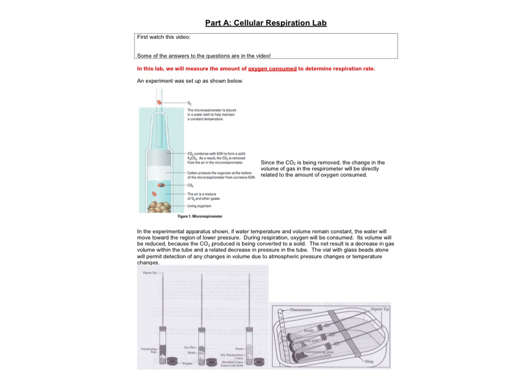We are very fortunate to have money in our budget to buy really nice probes and really nice electronic devices that can measure changes in gas levels, but a lot of schools don't have that equipment and don't have that financial capability. So why we look at this data and look at this lab is because College Board does believe that this is a quality, good setup for measuring respiration, and thus occasionally we will see questions on the AP test about this type of setup.